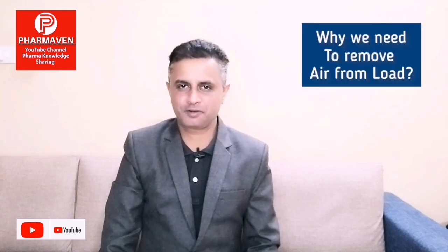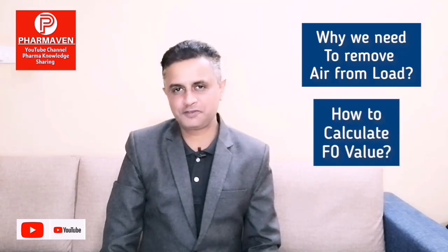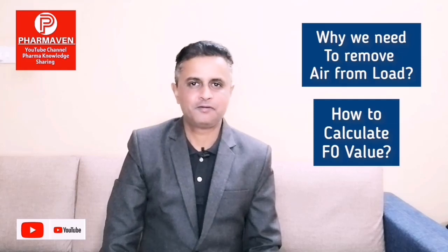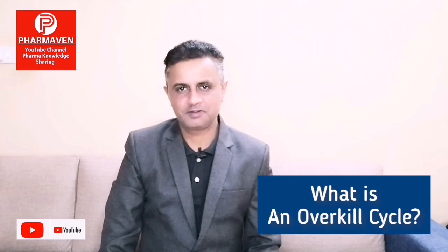Hi, in this video we will understand 3 important things about sterilization. First is why we need to remove air from the load. Second, how we can calculate the F0 value for required sterilization. And third, what is an overkill approach cycle. So let us begin with why we need to remove air from the load.